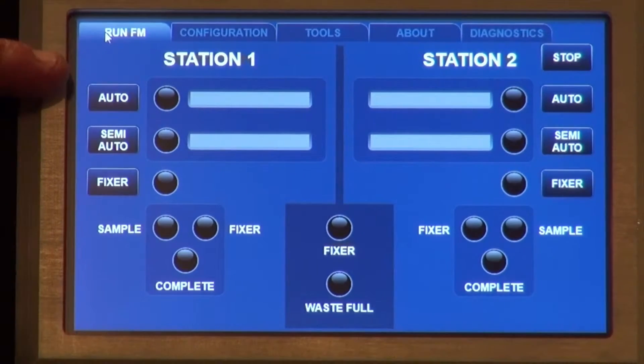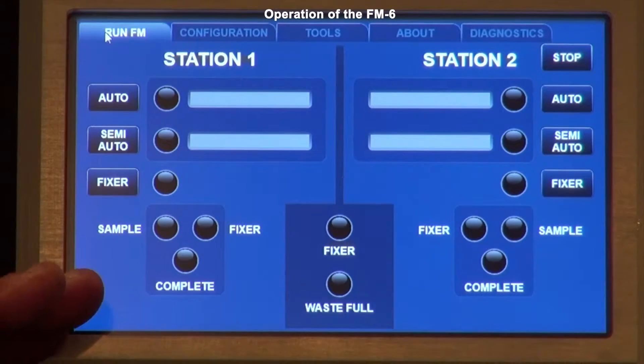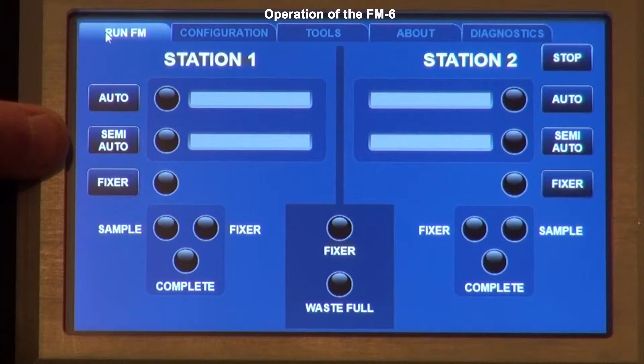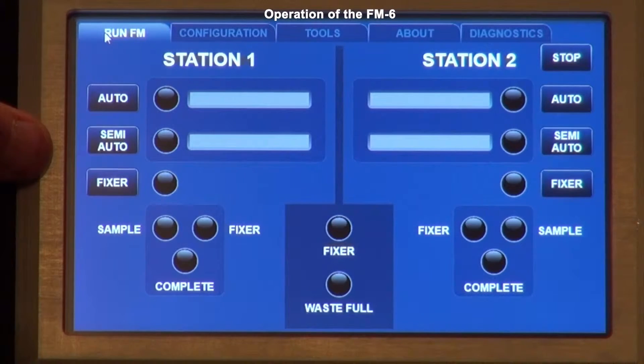Looking at the operating menus, the first tab is the Run FM menu — your primary tab for sampling with station one and station two. It's divided down the center; everything related to station one is on the left, station two on the right. You have an automatic button, a semi-automatic button, and a fixer button. The automatic button goes through the entire sample procedure from start to finish, pumping the sample onto the slide and then putting the fixer down. The semi-automatic button allows you to stop after the sample is complete to do a wash cycle with the fixer, depending on your lab's SOP.